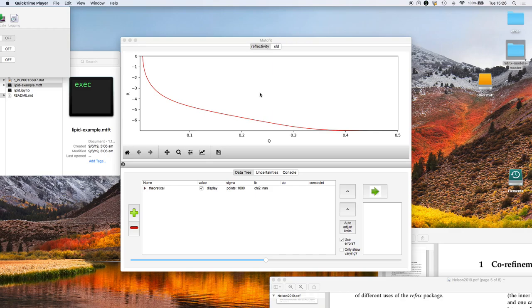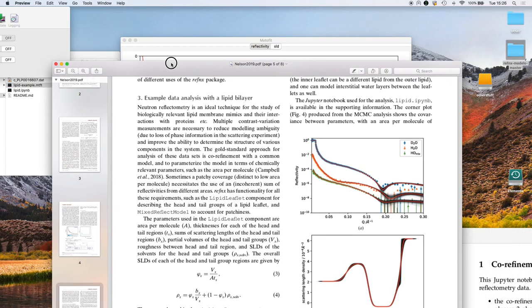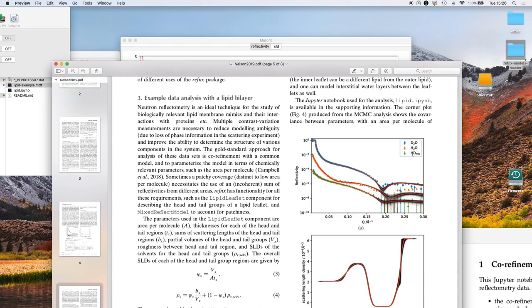Well today I'm going to show you how to do Markov chain Monte Carlo sampling in the Refnex GUI. The example we're going to use comes from the Refnex paper and it's scattering from a lipid bilayer in D2O, H2O and HD mix.